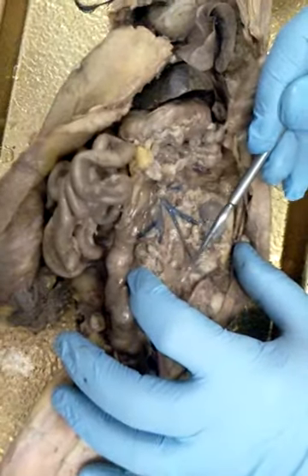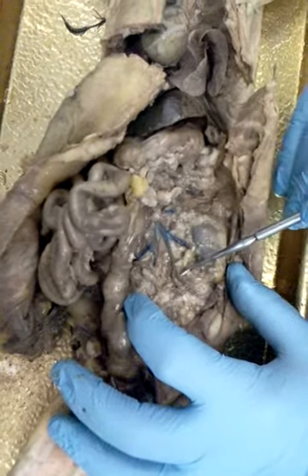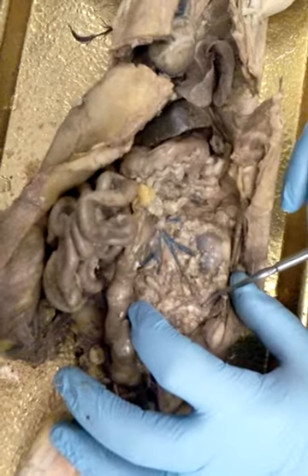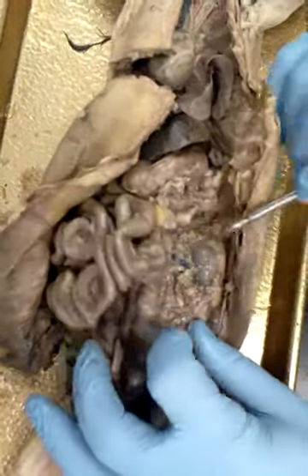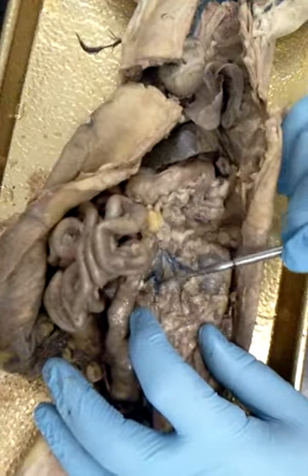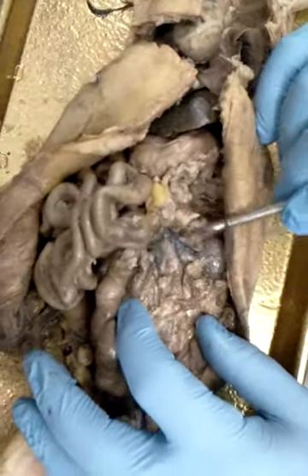There's the gonadal artery. Gonadal vein. Going right to the gonads. There's the gonadal vein. And for a female, what is it called? The ovarian artery? Ovarian. It looks the same. All right. Okay.